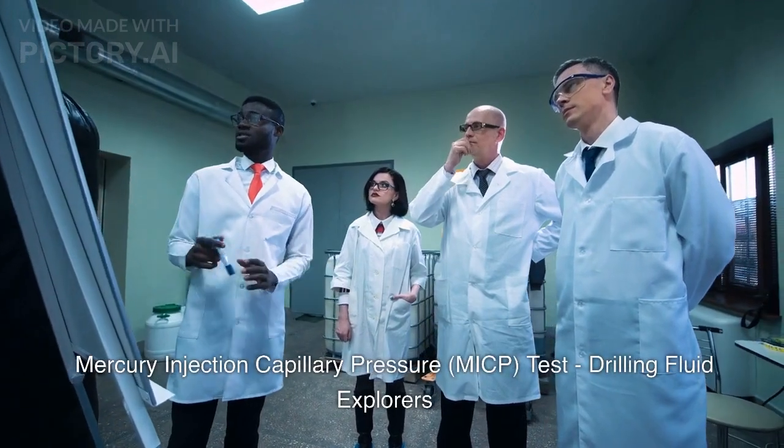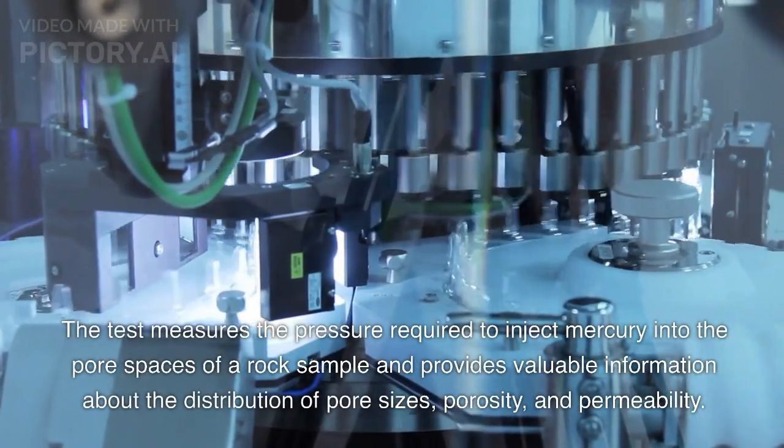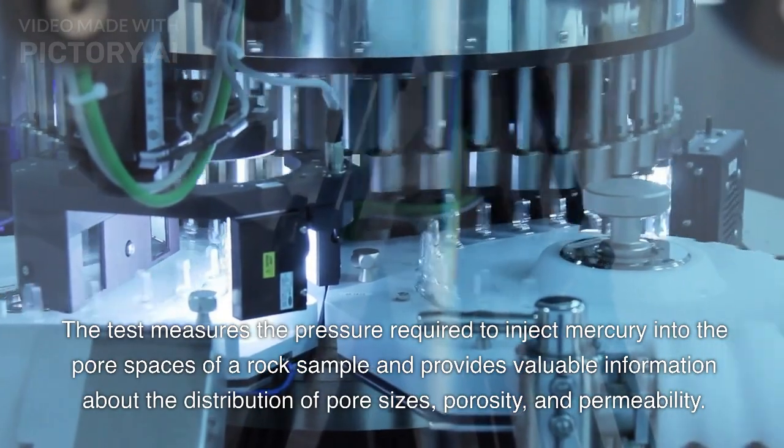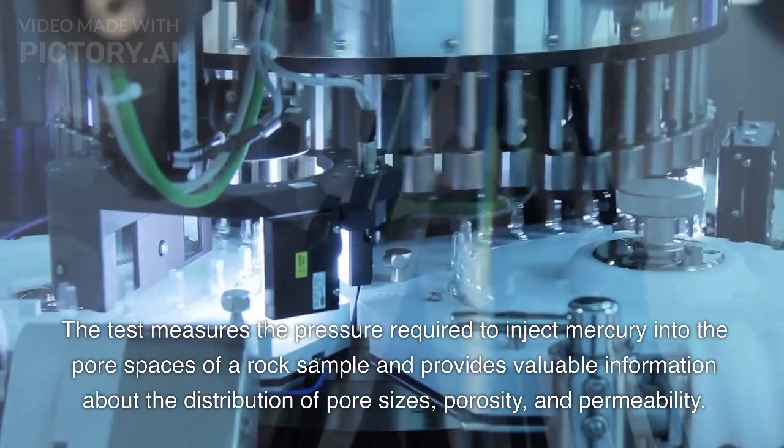Mercury Injection Capillary Pressure (MICP) test, drilling fluid explorers. The test measures the pressure required to inject mercury into the pore spaces of a rock sample and provides valuable information about the distribution of pore sizes, porosity, and permeability.